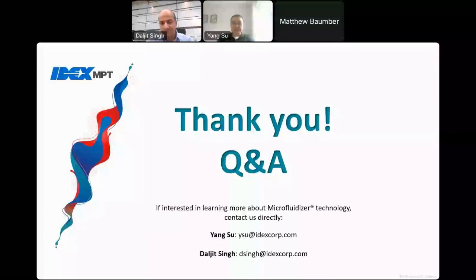Right, great question. So we do a lot of work in our design process to design our multiple channel chambers. The one thing we need to make sure, like I mentioned in the presentation, is you need to be able to maintain the pressure. When we use a multi-slotted interaction chamber for a larger scale machine, we will carefully choose the number of the channels so the machine can still achieve the desired process pressure. So as long as the machine is capable of maintaining that pressure, we know the pressure across each channel will be the same and the material will receive the same treatment. And this has been demonstrated and proven over and over by many of our customers using our production system, including one of the examples I showed in my presentation.